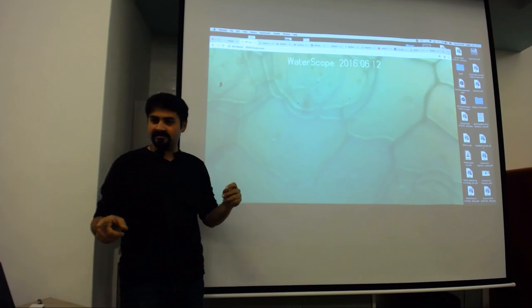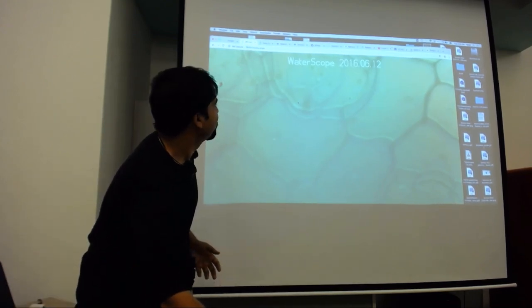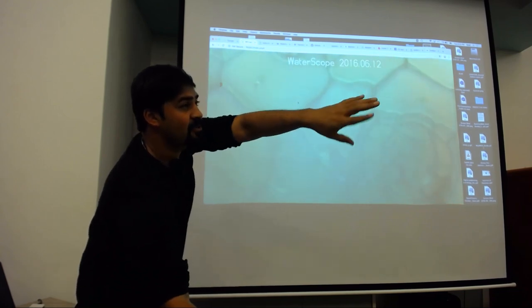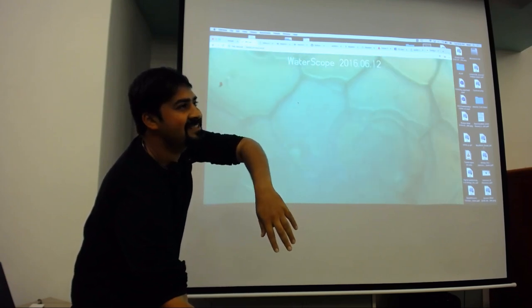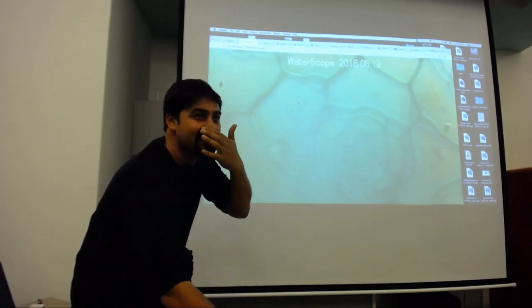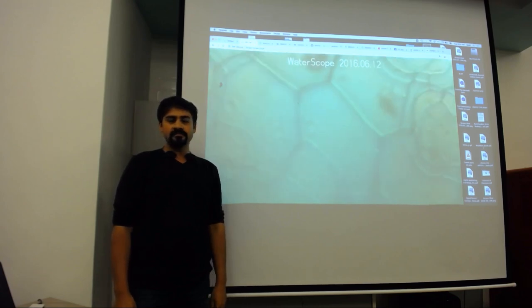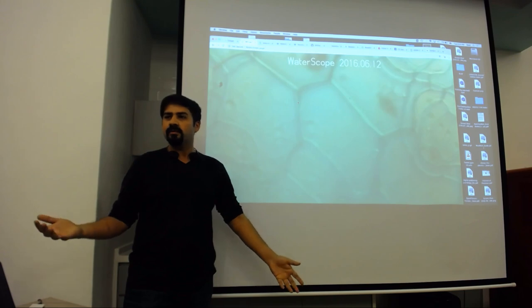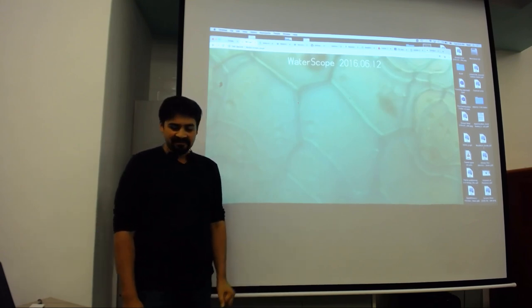You seeing it? Well, you're recording, so you're definitely seeing it. Yes? And so, can you just hold it up? So it live updates, doesn't it? Yeah. Ah, this is excellent. It's actually working. Gabriel's got it as well. So imagine this in a classroom setting, where you have one instrument and everybody else is staring at their phones anyway. Might as well show them something interesting.